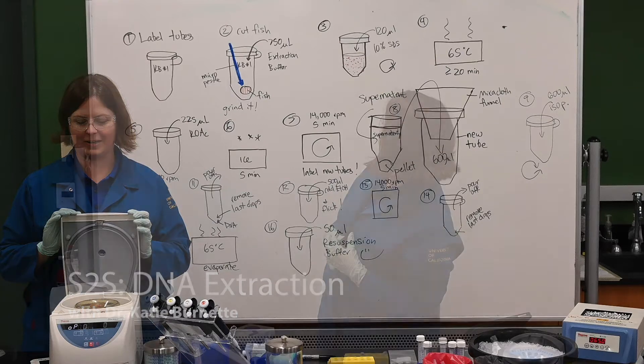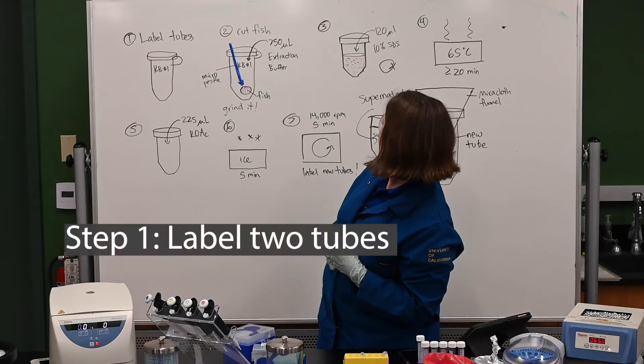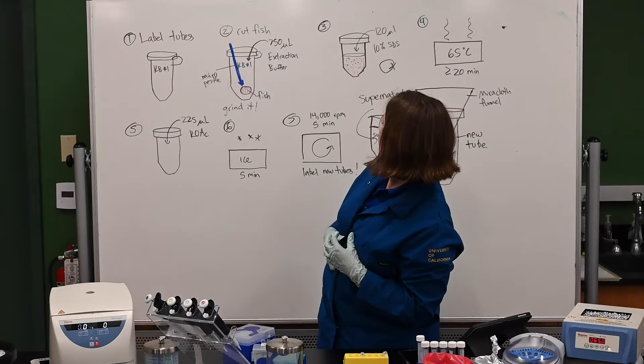Hi folks, it's Dr. Katie Burnett here. Today we're going to talk about how to get DNA out of fish. Step one, label two tubes. Make sure you put your initials and the number of the fish.